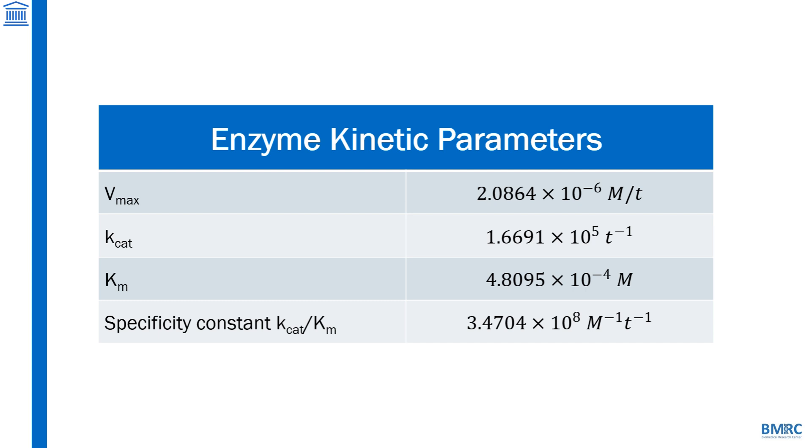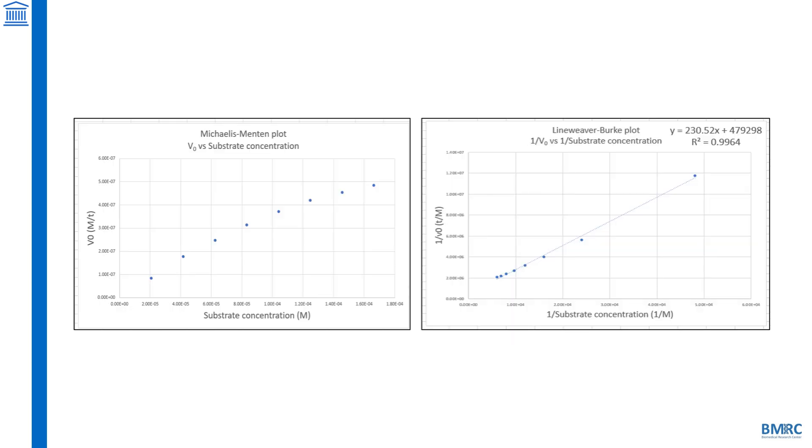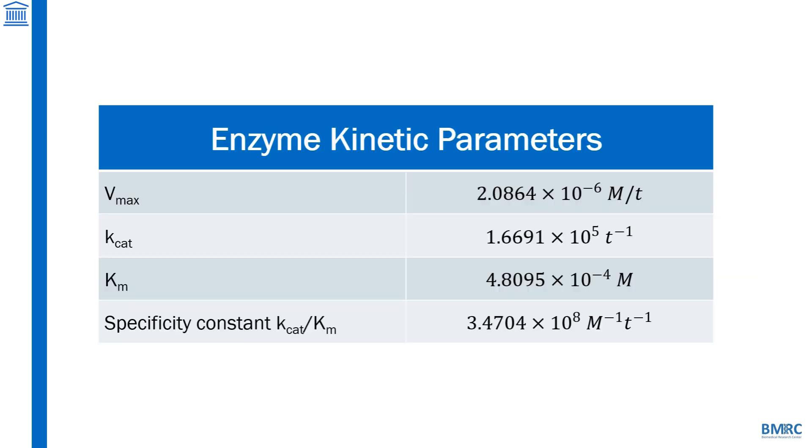You've successfully completed the enzyme kinetics calculation process by making the Michaelis-Menten and Lineweaver-Burk plots to determine the critical parameters Vmax, Kcat, Km, and Kcat over Km. I hope you learned something, and good luck in the practical session!